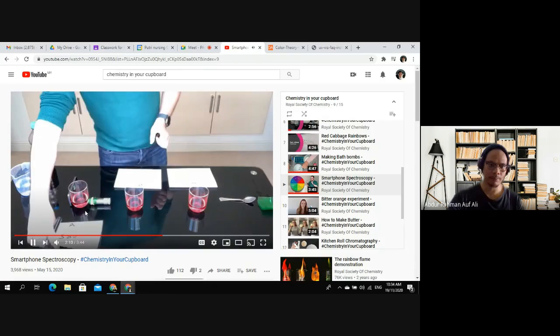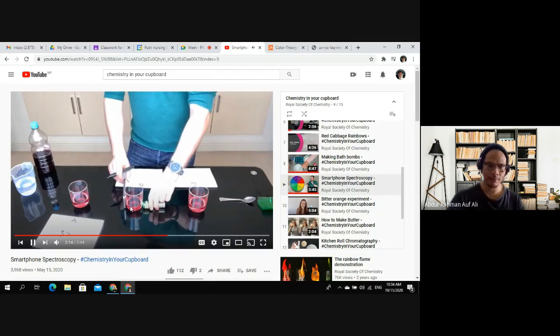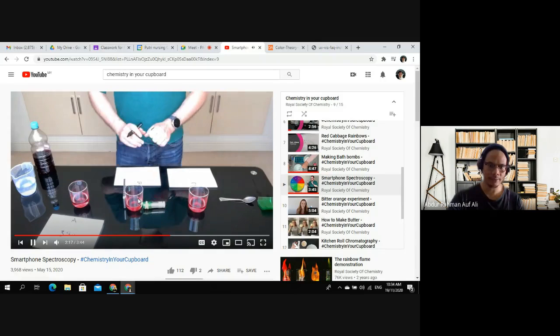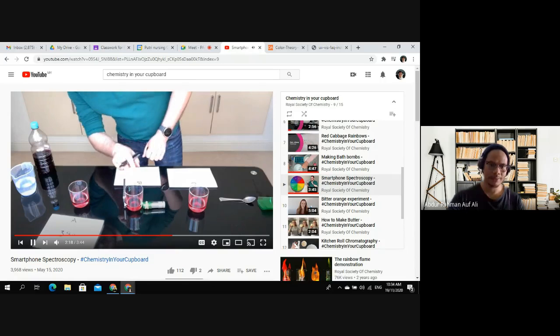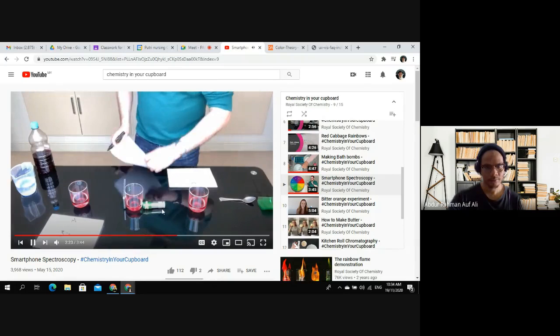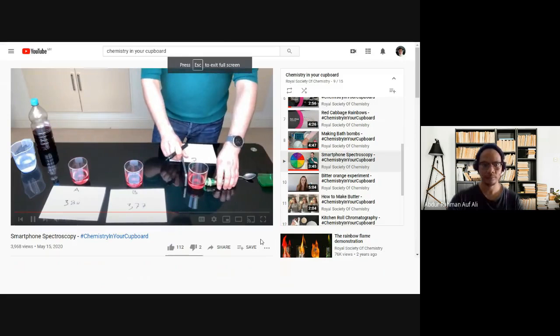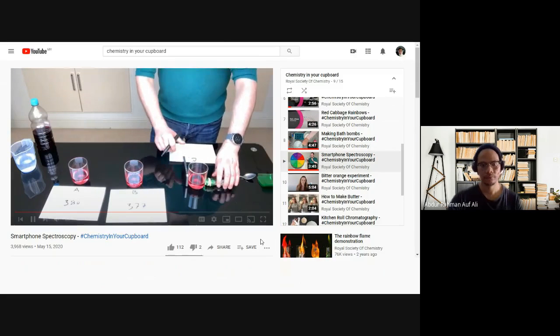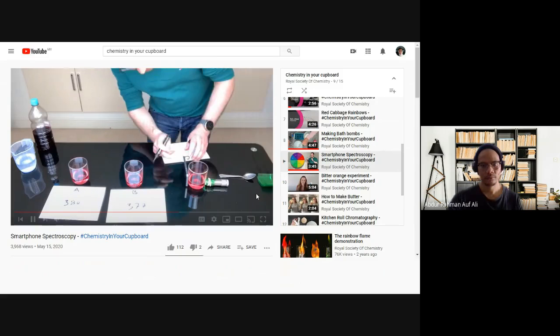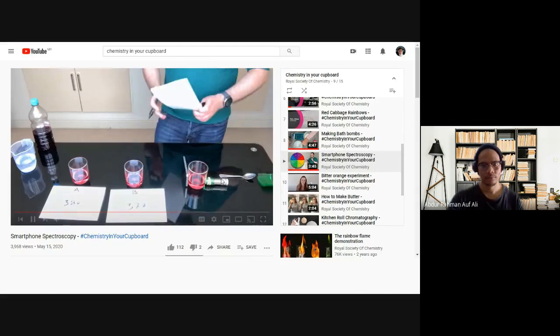Okay, so dia ambil bacaan in the first solution. Kemudian dia repeat the same step on the second glass. Ambil bacaan and then record. Let's see, be clear. And then dia buat.